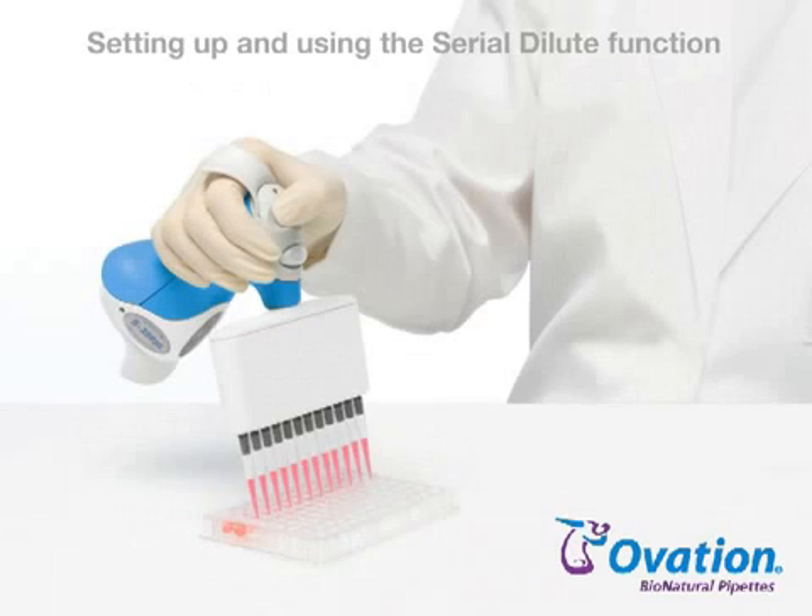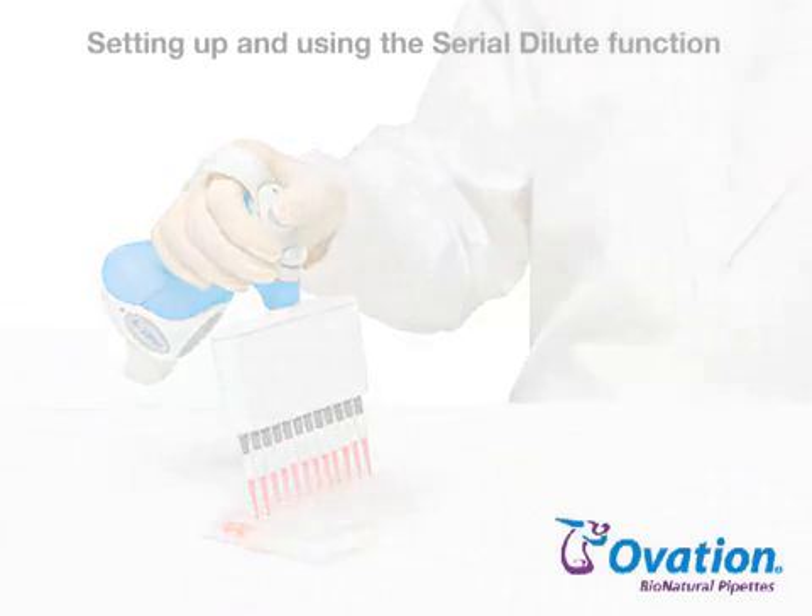The Serial Dilute liquid handling function performs sequential dilutions. An initial sample volume is aspirated, dispensed into diluent, and then mixed. The diluted sample is then aspirated for addition to the next diluent. To set up and run the Serial Dilute liquid handling function, follow these steps.